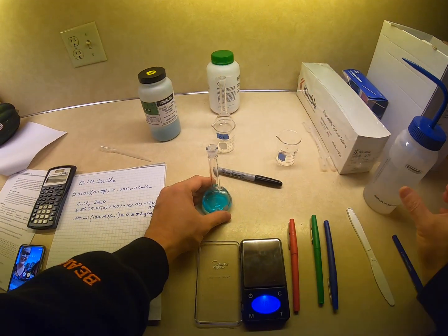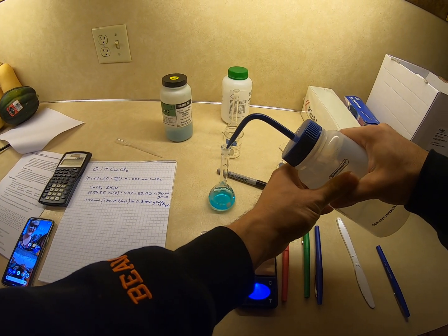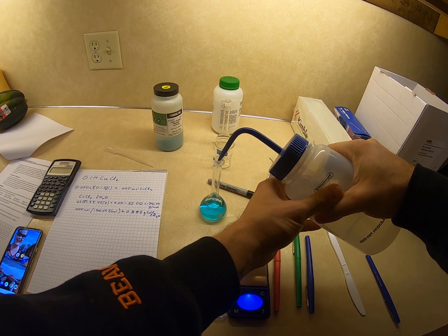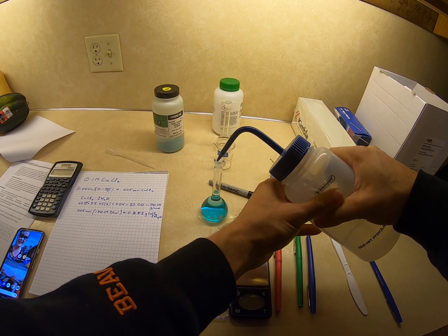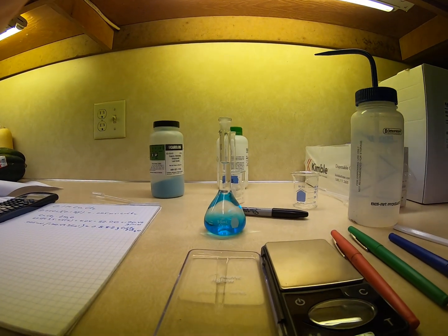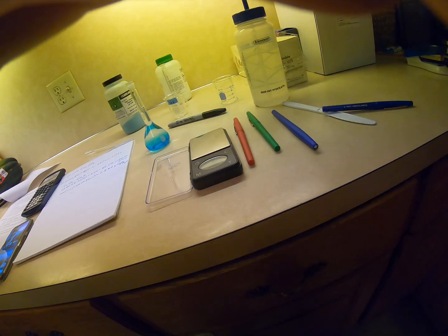And then when making a solution, I'm going to fill up carefully to the fill line. I'm going to get my meniscus. Well, hopefully you guys can see this. So I slow down at the neck. I'm going to go till my meniscus is at that line, bottom of the meniscus. And then I will get some saran wrap and invert this.